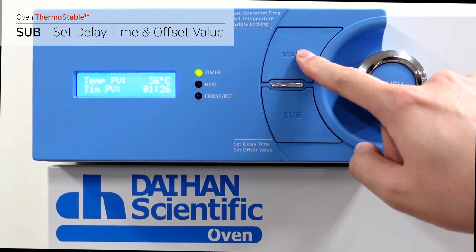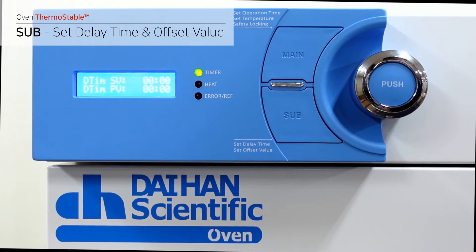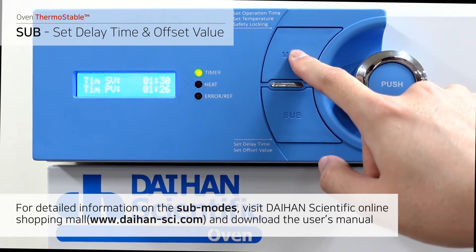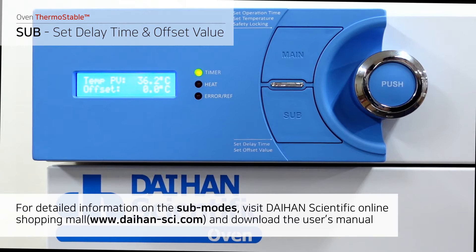Press the sub button under each setting mode and it will enter the respective sub mode to set temperature correction and the delay timer. For detailed information on the sub modes, visit Daehun Scientific's online shopping mall and download the user's manual.